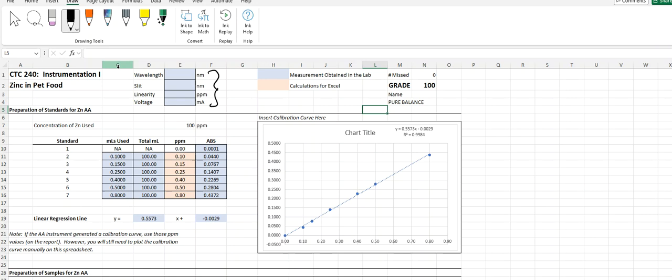Very often these metals will have a linear range where the beginning and the end window is suitable for the AA instrument as far as standards go. So you'll be able to find that. We've got one of those reference books in the lab. We'll show you where it's at if you ask for it. You can just find zinc, and zinc will have it stamped on there. Here is the linearity, and you just go from there.